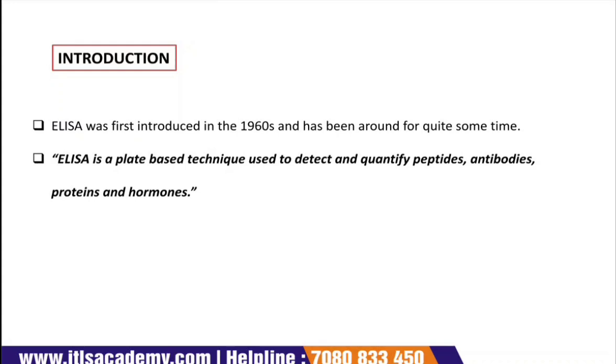Now, why is it used in food industries and why does it have so much application in food industries? In food safety testing, ELISA plays an important role in reliably detecting contaminants such as mycotoxins and allergens, as already told you in the previous slide. It also helps to ensure product safety, maintain product integrity, and verify compliance with labeling regulations.